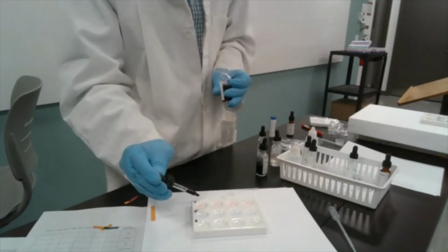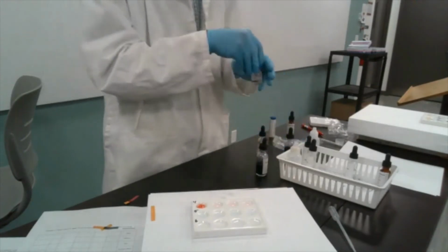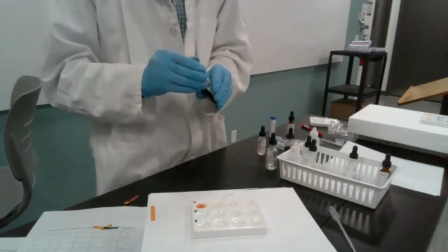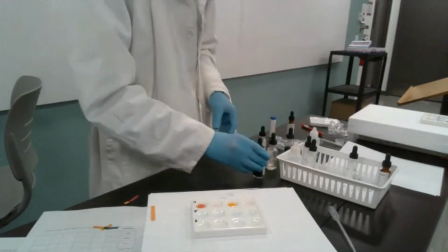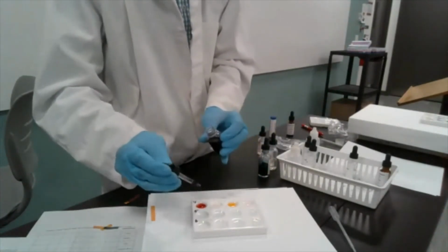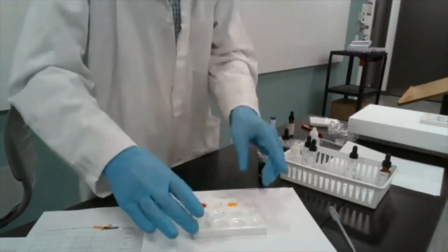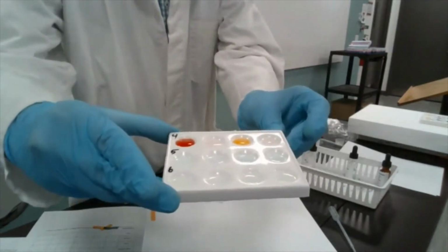Blue litmus into the first well of the grapefruit juice. Then goes phenolphthalein. Finally, bromothymol blue. And lastly, let me just add a bit more litmus. I think I used too small of a drop. And lastly, universal paper. But before I dip that universal paper into the well, let's look at the color change.